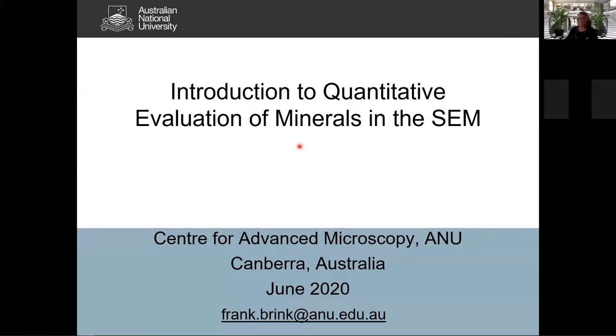An introduction to quantitative evaluation of minerals in the SEM. These days, it's sometimes referred to as automated quantitative mineralogy, or AQM as a more generic term as well. I'm based at the ANU in Canberra, where I am the operations manager of the Centre for Advanced Microscopy. My experience is mainly in the physical sciences, specifically solid-state chemistry, physics, and I've also done quite a bit of work in mineralogy, or analytical mineralogy.